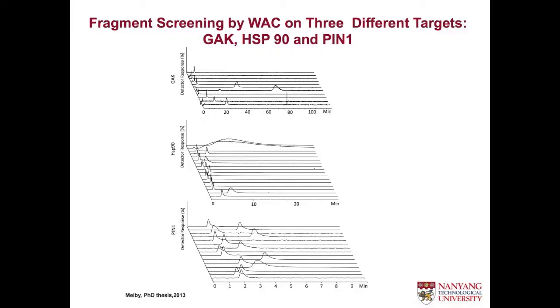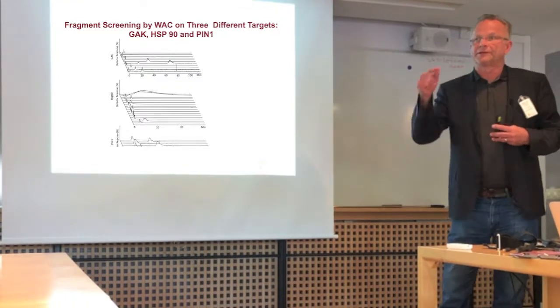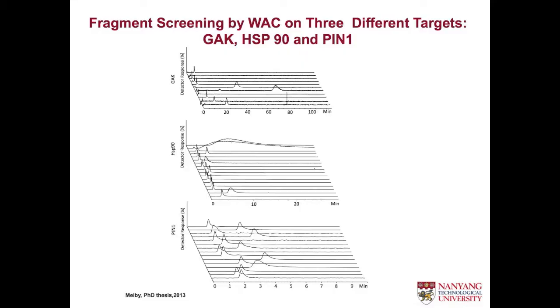And here you can see why we are working with mixtures, because that's one of the beauties. We can mix everything in one package, because MS can detect every fragment if they are different enough. So we have a barcode on every fragment. Here in this case maybe we have 10. You can see all these retention times are individual for each fragment. And the retention time gives you directly the affinity here.